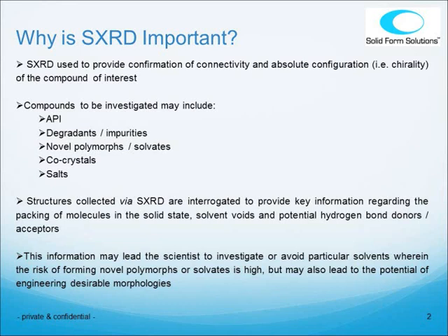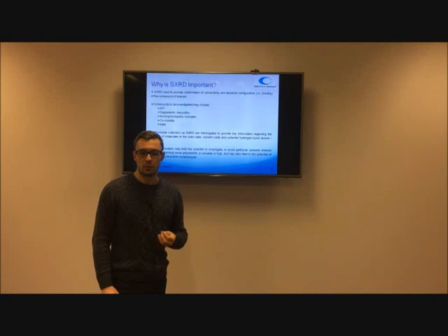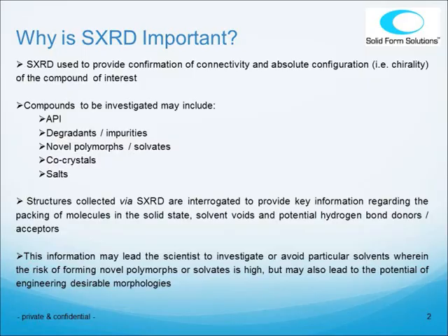and salts. Structures collected by single crystal X-ray diffraction are interrogated to provide key structural information regarding packing of molecules in the solid state, solvent voids and any potential hydrogen bond donors or acceptors. This information may then lead the scientist to investigate and avoid particular solvents wherein the risk of forming novel polymorphs or solvates is high, but may also lead to the potential of engineering suitable morphologies. This is particularly useful when we end up with a polymorph which may give us a morphology such as a needle.